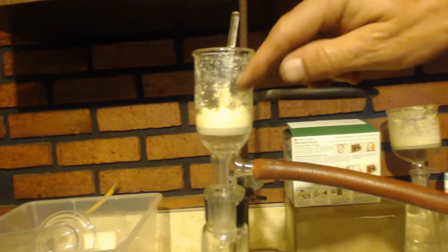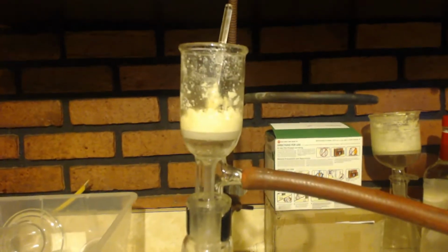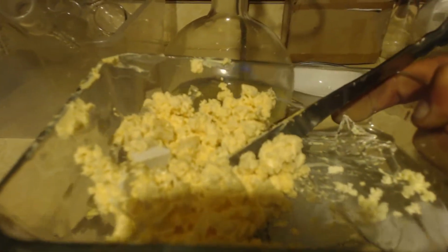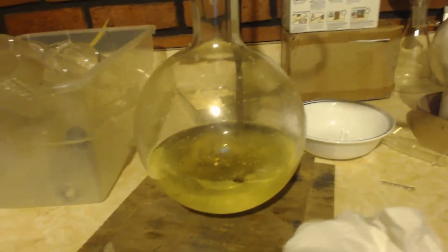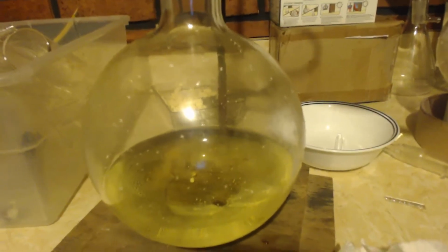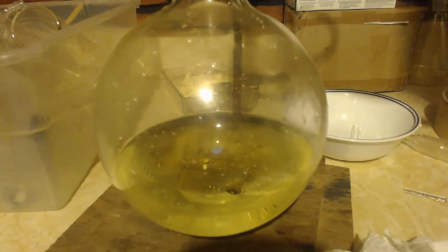So I filtered what was in the pot. Okay, so there's two batches. Remember, I got this stuff out and I washed it with 500 milliliters of water. That 500 milliliters of water and the pot I put into the freezer, and this is what preciped out. Not much, but whatever. Now this is the pot that has the nitric acid and xylene in it. I'm going to add, say, 200 to 250 milliliters of water to that, and I'll put it back in the freezer and see if that helps more stuff precip out.